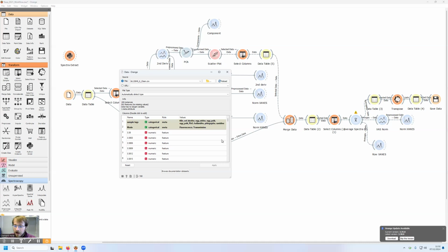For information, you can add as many metadata columns as you want. So if you have other information that you want to add, don't hesitate to open the CSV file in Excel and manually add new columns of metadata. For instance, the provenance of the sample, or additional information about the dead time, etc.